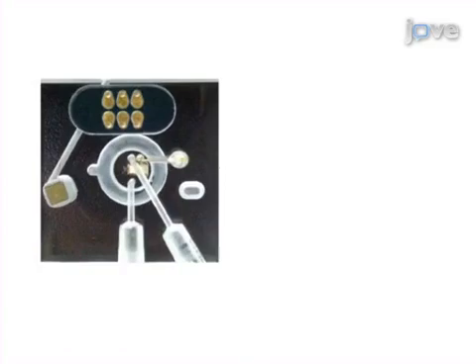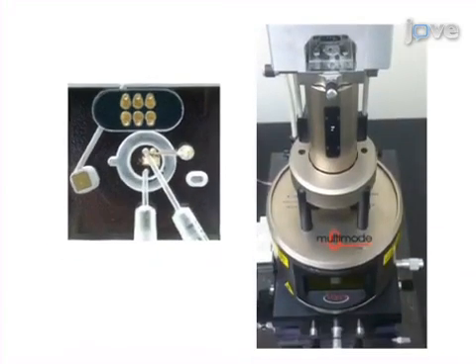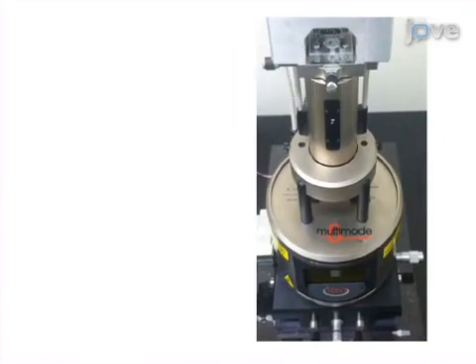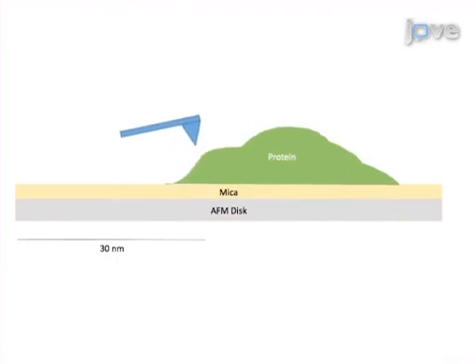Next, the sample is attached to a liquid cell that is equipped with an appropriate probe. This assembly is loaded onto the scanner. After filling the liquid cell with buffer solution, engage the tip with the sample and begin scanning.